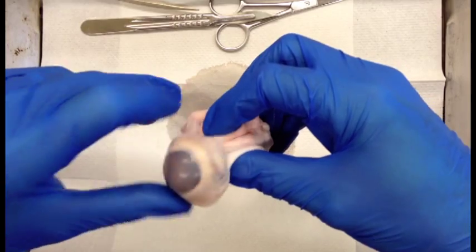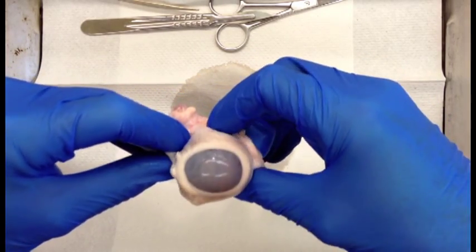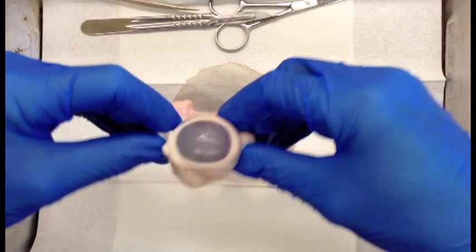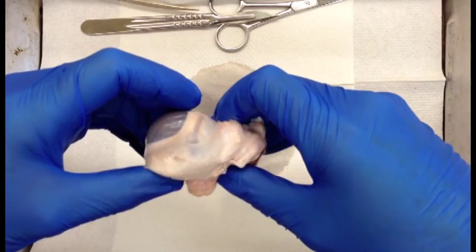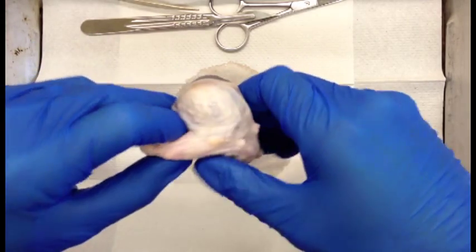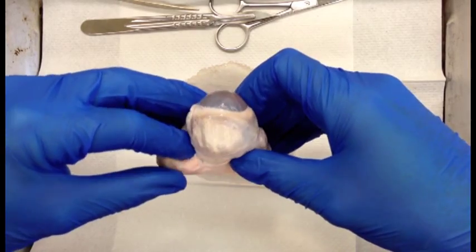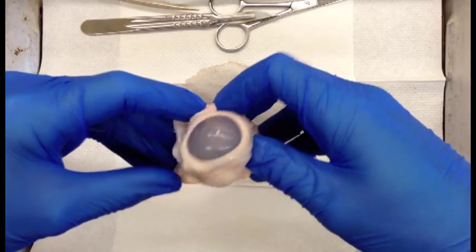And that works great because then the tissue doesn't rot and break down as easily, but it also is much harder and stiffer. So with a fresh eye, the tissue is a lot softer. It's obviously more of what it would be like when it's in the animal, when it's alive. So I'm going to go ahead and just point out some of the features of the eye that we can see on the outside before I start cutting into it.